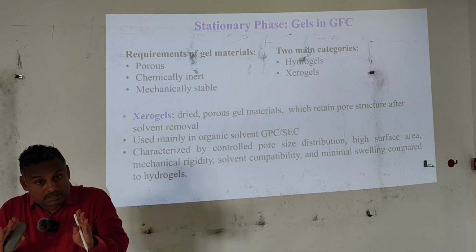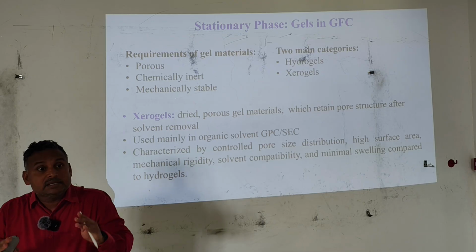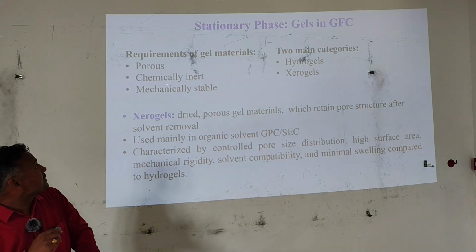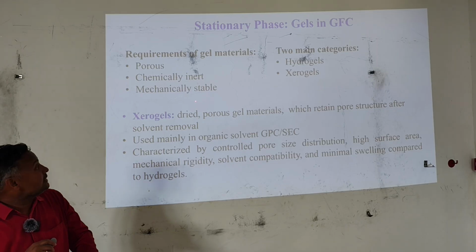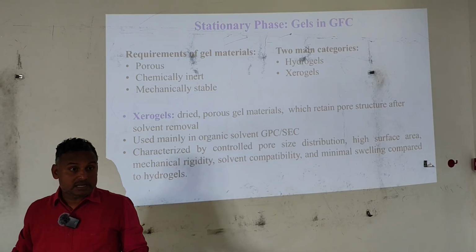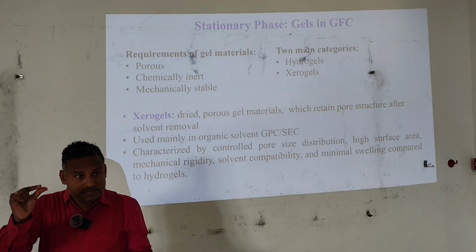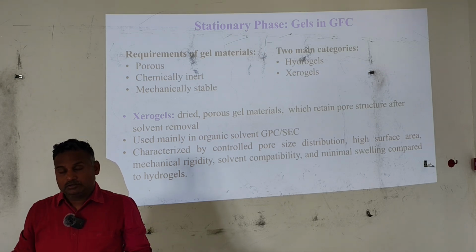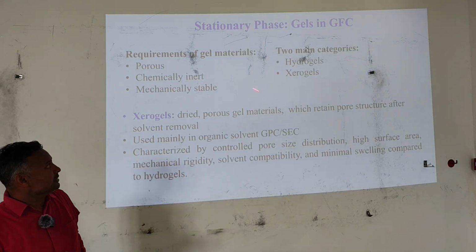No interaction; that means chemically inert. And mechanically stable, that means those porous beads must be mechanically stable. So these are the requirements of gel materials.